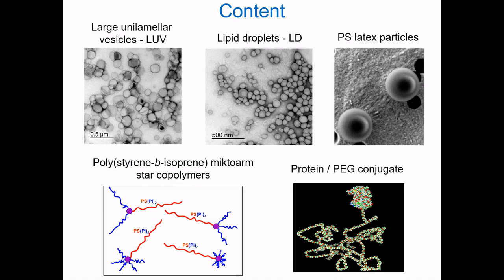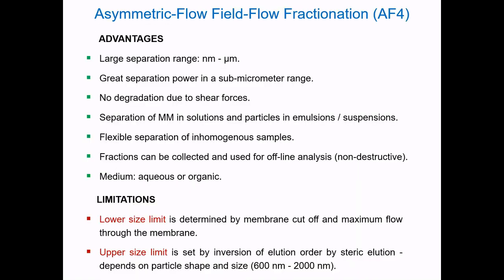Here we used a combination of various separation and characterization techniques, among which the use of a multi-detection system coupled either to SEC or AF4 was essential. In the introduction part, I'd just like to highlight the advantages of AF4 over more conventionally used size exclusion chromatography.